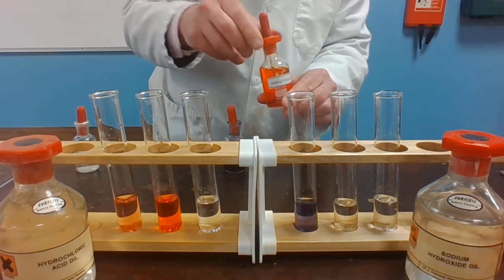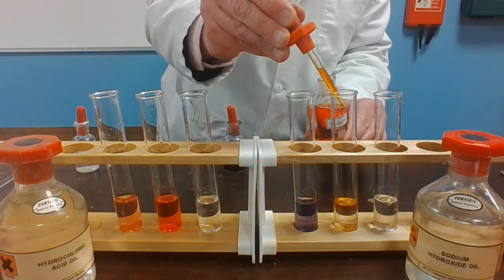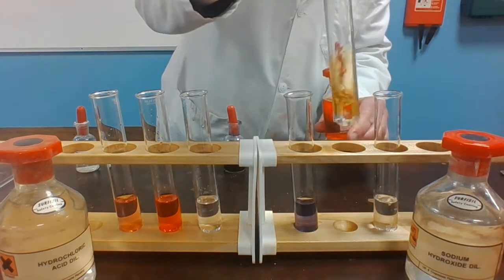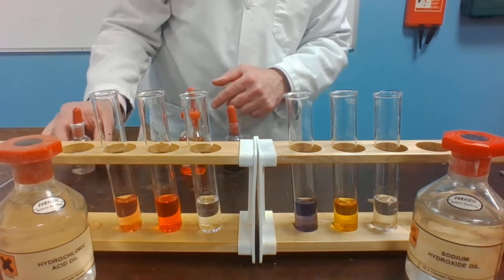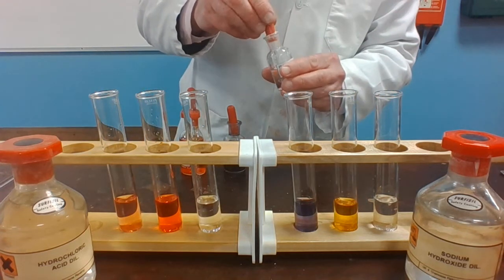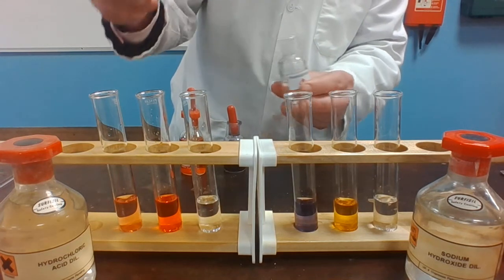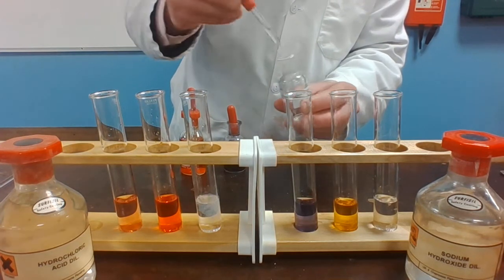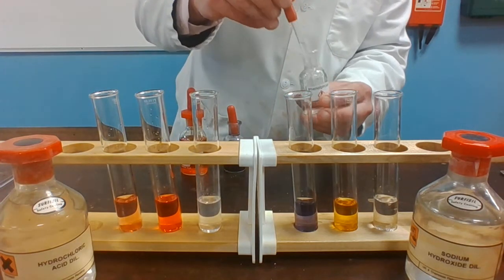Adding methyl orange indicator to the acid and it turns again a sort of red-orange color. Add it to the alkali and it is a yellow color. And finally, adding phenolphthalein indicator to the acid — it goes a bit white but there's no color change there.